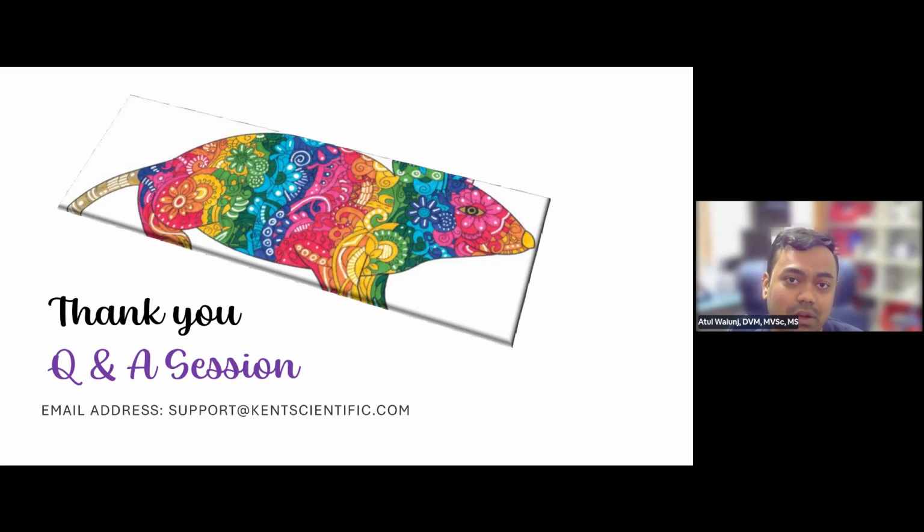However, it will in turn cause local or superficial burns to the animal, so you do not want that. There is no other way to provide in-depth tissue warming without causing local burns. So, in short, electrical heating pads are not the best for deep tissue warming.